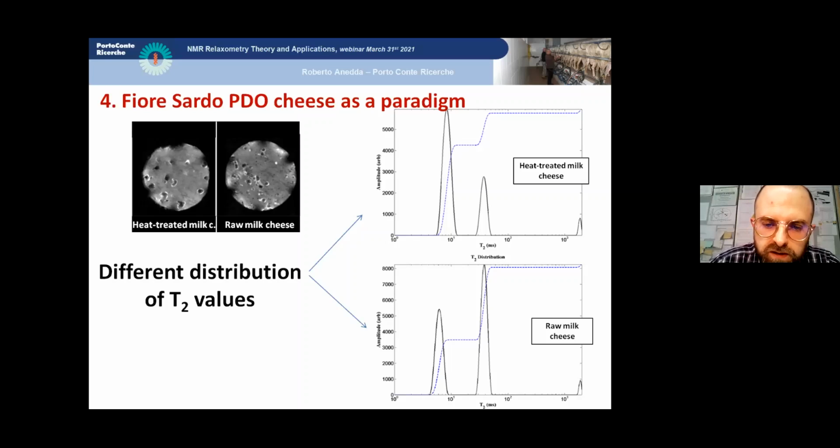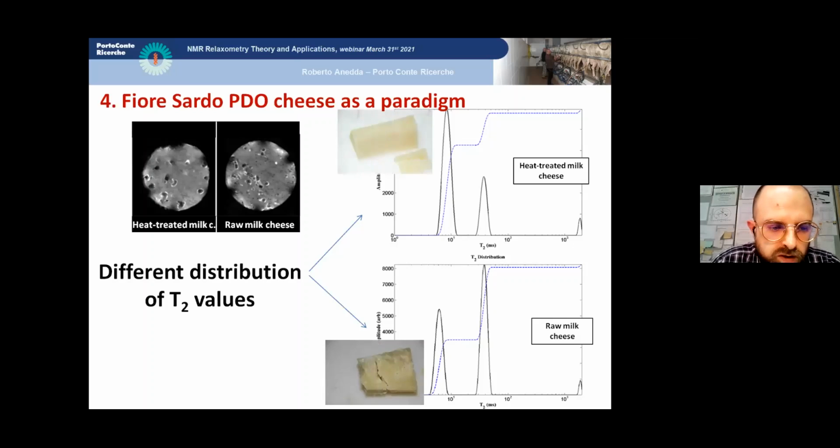These results were obtained on cheese after 3 months or 6 months of ripening and appear quite reproducible. We have tested several tens of cheese samples by now, also specifically produced. And statistical analysis usually confirms that NMR relaxometry is sensitive to these macrostructural changes. It is very interesting that visual examination of the two cheeses shows that cheeses from heat-treated milk were characterized by a very different appearance than the raw milk cheeses.